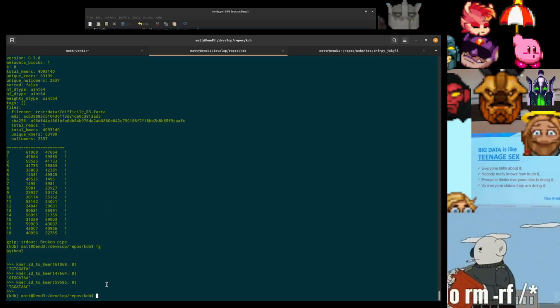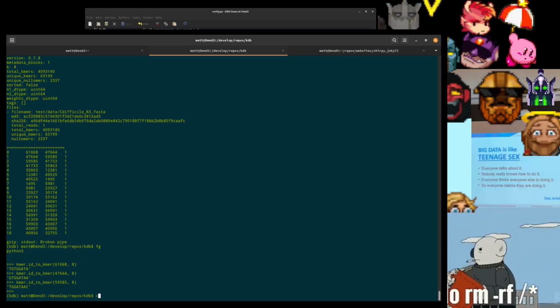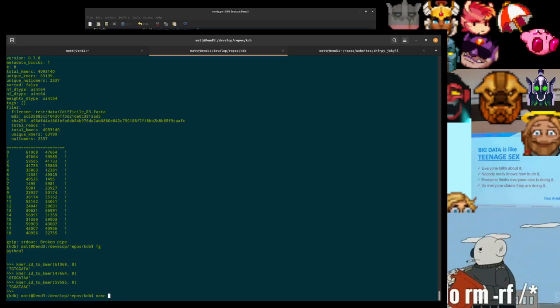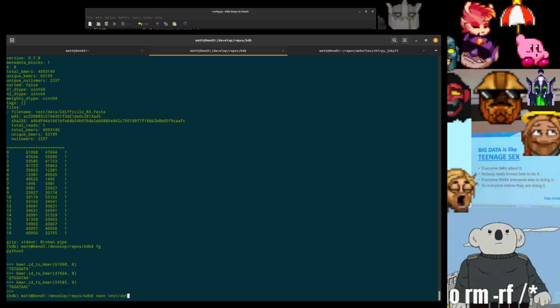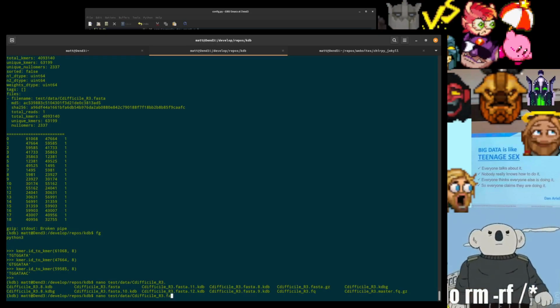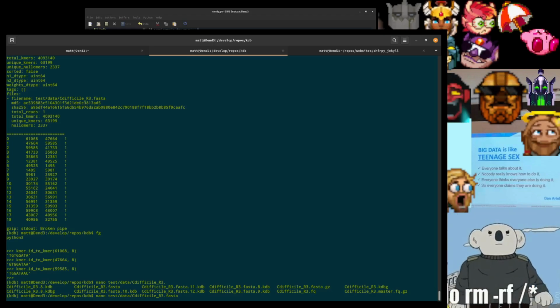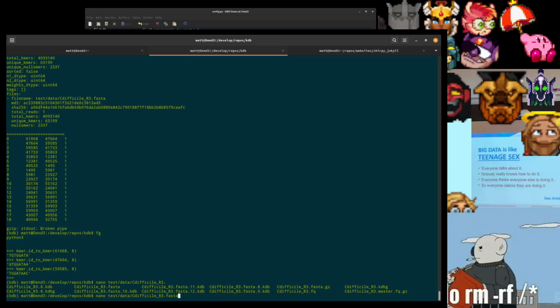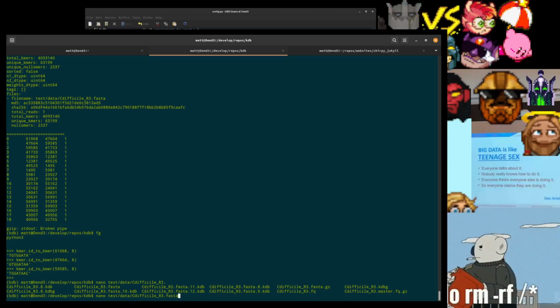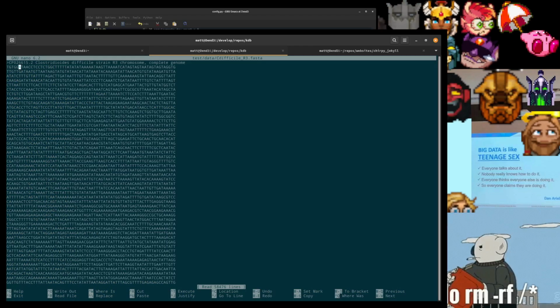In fact, let's go ahead and convince ourselves of this, that the first eight letters of the C. diff R3 genome are TGTGGATA. TGTGGATA.